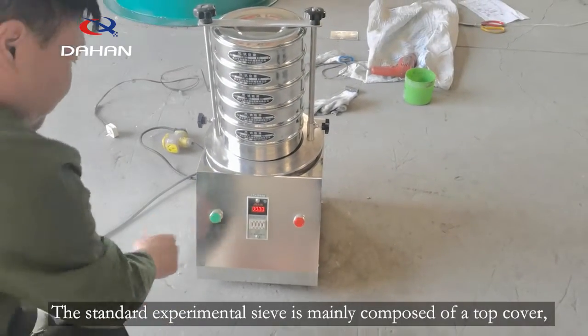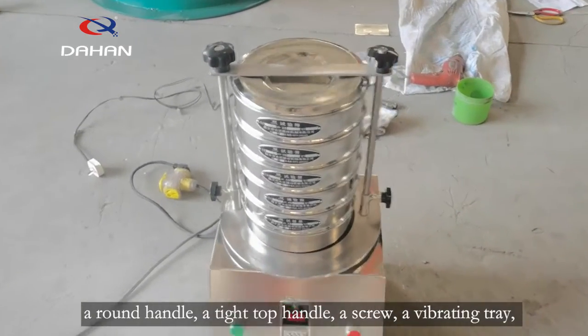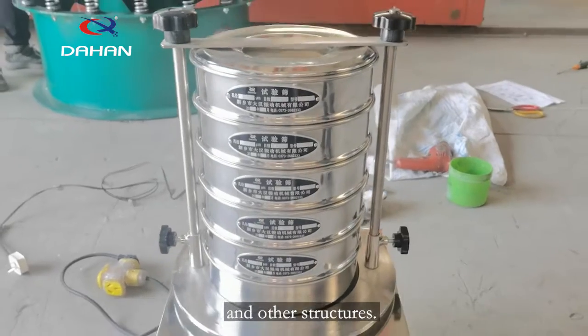The standard experimental sieve is mainly composed of a top cover, a round handle, a tight top handle, a screw, a vibrating tray, and other structures.